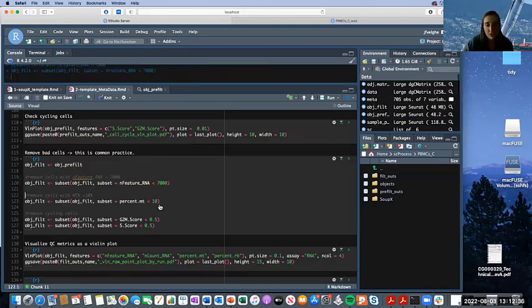The next thing we're going to do is make sure that the cells in our data set have less than 10% mitochondrial percentage. I've seen anywhere from 5 to 20 used as the percentage of mitochondrial genes. The reason we filter out those with more than 10% or more than 20% is that we start to see mitochondrial leakage when cells get stressed and are dying.